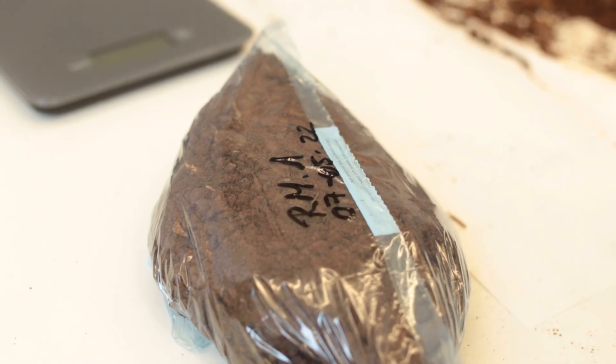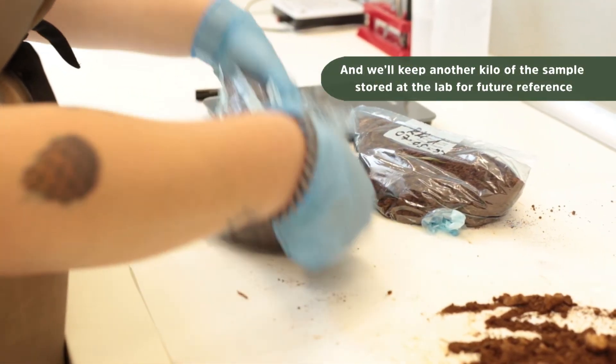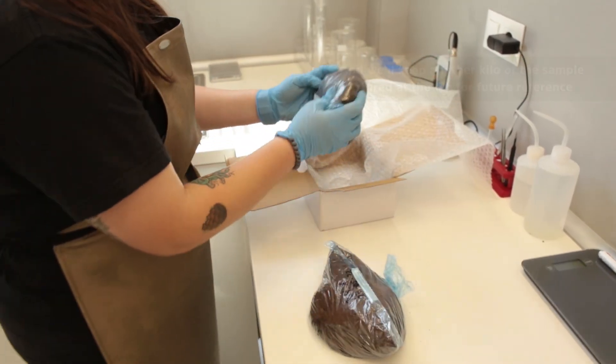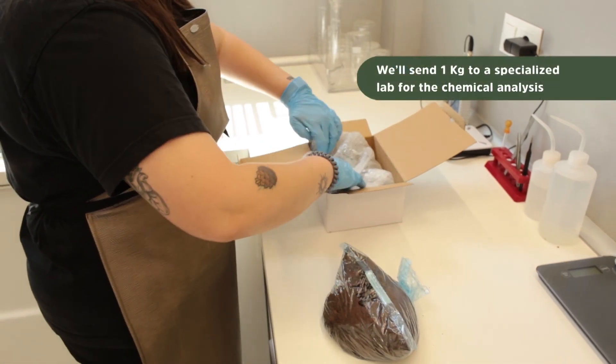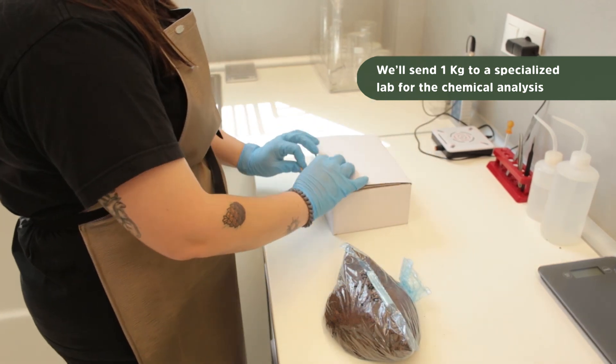We will also keep about a kilo for future reference. So we always ask you to please send at least two kilos of soil per sample — enough for the chemical analysis, enough for the preliminary tests, and enough to keep a sample at the lab in case we need to reanalyze anything later.